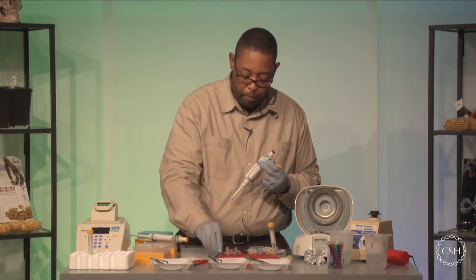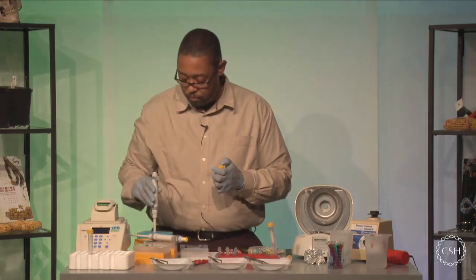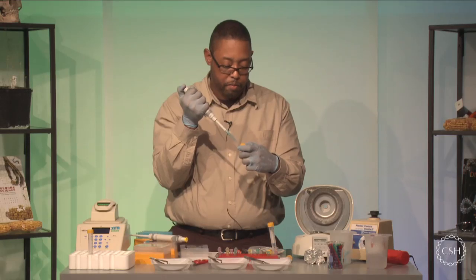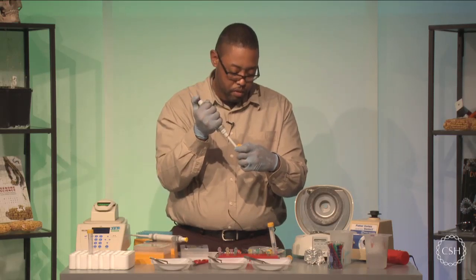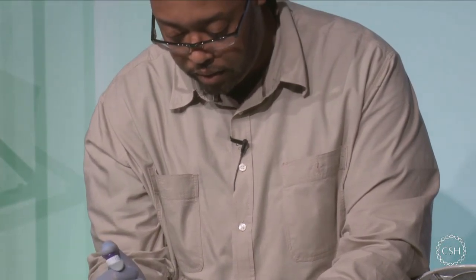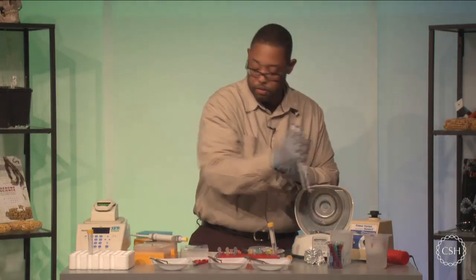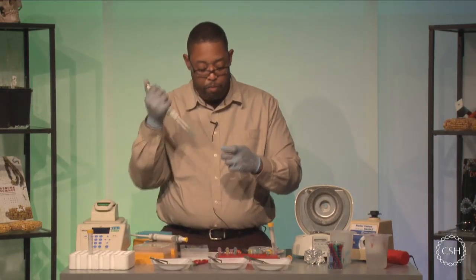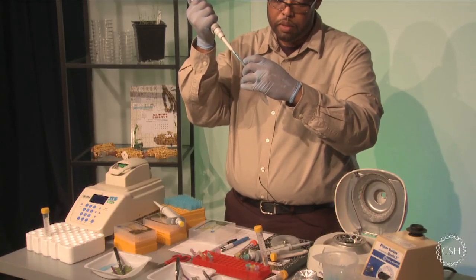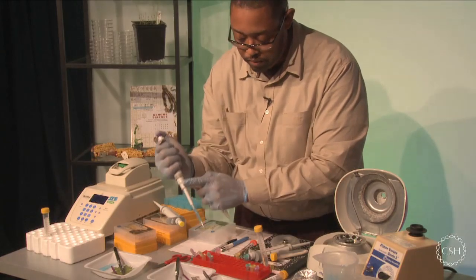I'm just going to open up all my test tubes here on the table. And what I'm going to do is draw up 500 microliters of my wash buffer, and I'm going to add that to each test tube. Again, be mindful to make sure that you're changing tips each time that you add wash buffer to each test tube.